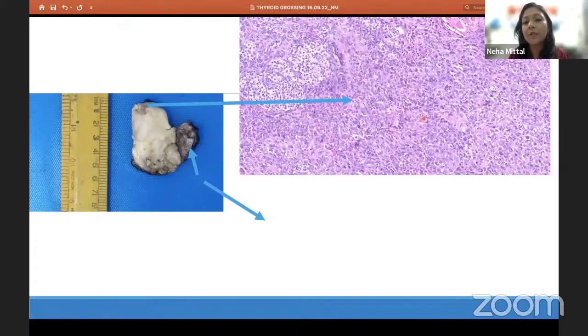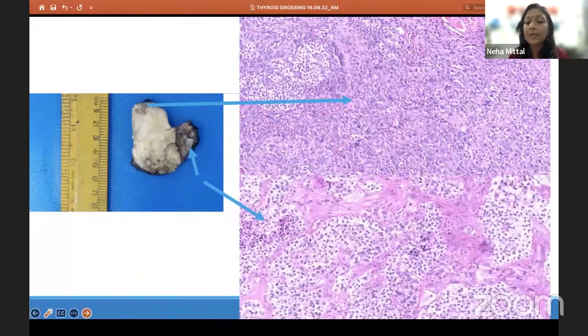You can see a very undifferentiated looking sarcoma. But only when they sampled this different looking, pale brownish area, that we discovered that this was actually a parathyroid carcinoma, which was having this kind of an anaplastic transformation, so to say. The present terminology is not clear. Only 2 more cases are reported in the world. So this is actually a parathyroid carcinosarcoma. It's a very odd case, very rare case, but just to show you that even for lesions in the thyroid, in the parathyroid, submit all different looking areas for a proper categorization of the lesion further on.